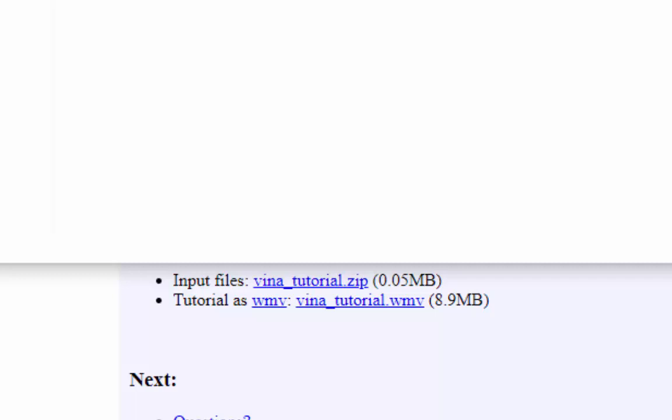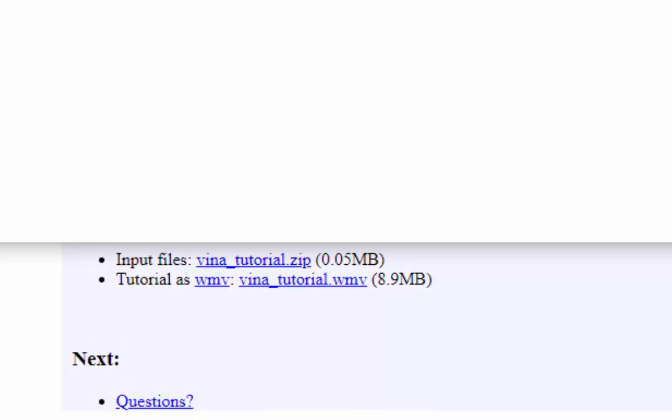protein file. Now, you can start out with a PDB file, and from our discussion, and you can look at the video about PDB, there is a certain format for PDB files. There's some additional information that's added, which kind of looks like a PDB file. It's called a PDBQT file, and so that's what we can also look for.